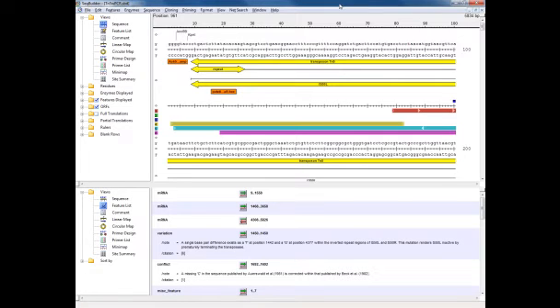SeqBuilder is LaserGen's application for sequence editing, annotation, and map creation, as well as for automated virtual cloning and primer design.